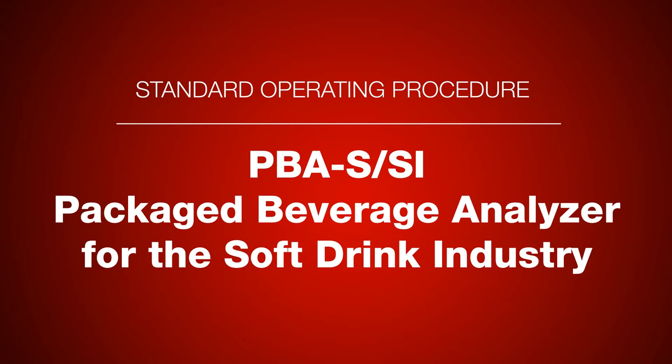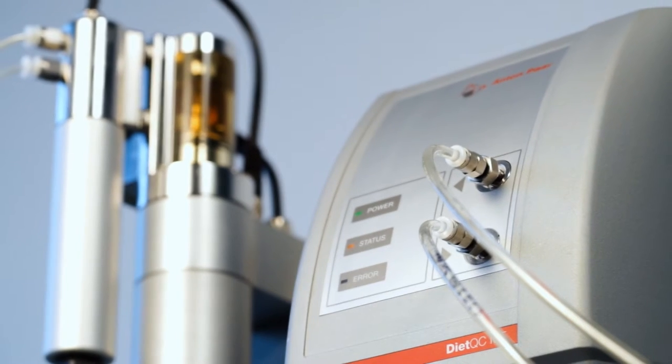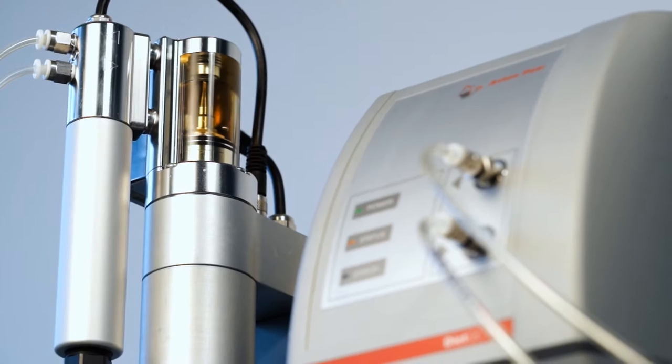PBAS and PBASI measuring systems are the ideal solutions for the final quality control of bottled beverages directly out of glass bottles, PET bottles or cans.